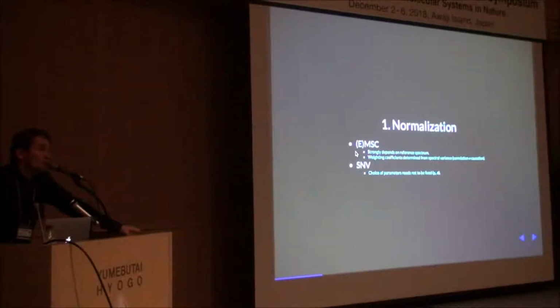What to use? Usually pure water is used, but we also know that pure water is not completely 100% free of scatter. So all scattering techniques heavily rely on reference spectra, and those are not easy to obtain in a theoretical manner.